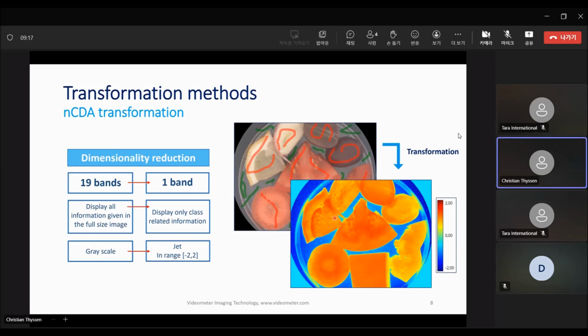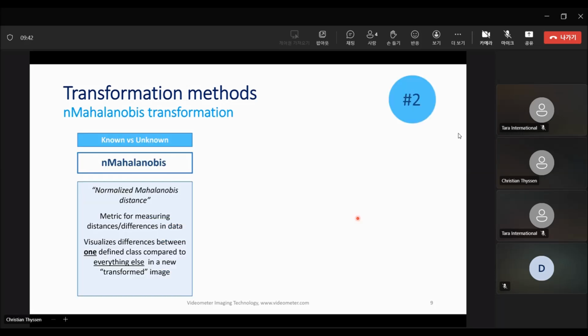And the way we can use this energy image now is that if you want to segment out these parts, you can say, okay, everything that is above 0 will be foreground, everything below will be background. You see that makes it easy to get all the samples as foreground, and you can then do further processing to separate them.